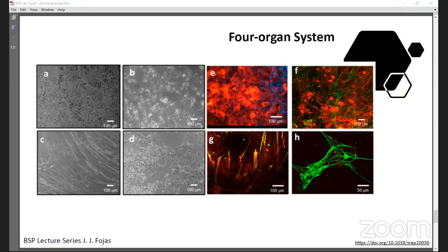Anyway, they've used 5 micromolar and then 100 micromolar. They also tested, I think, valproic acid as well, BPA, and then your acetaminophen, your APAP.